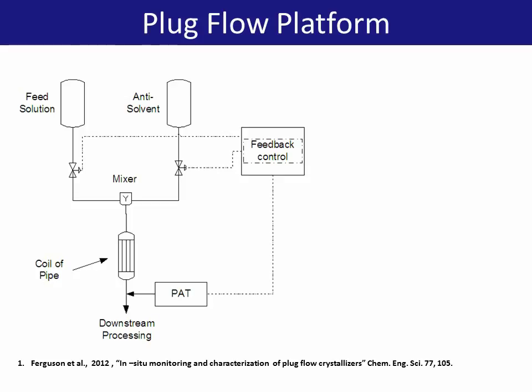As highlighted previously, all runs were carried out using an initial 100% anti-solvent charge. Subsaturated feed containing benzoic acid in aqueous ethanol solution is pumped from a feed tank and is brought together with an anti-solvent stream, which in the case of this system is pure water.